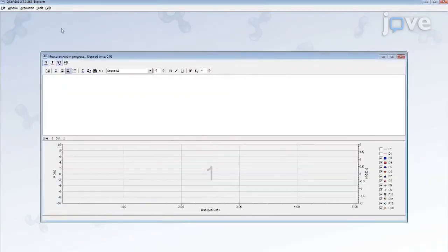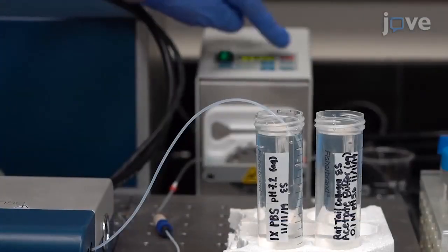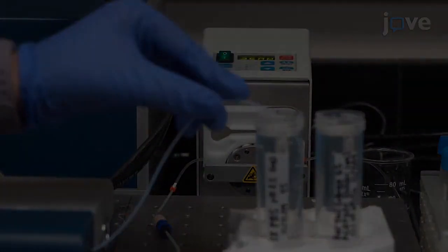In the software, press Start Measurement to start the measurement and begin data acquisition. Monitor the frequency and dissipation values for at least 5 minutes to ensure a stable baseline. Stop the pump and move the inlet tubing to the collagen acetate buffer.